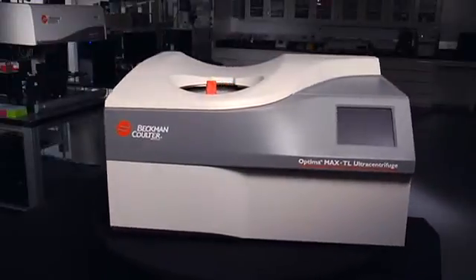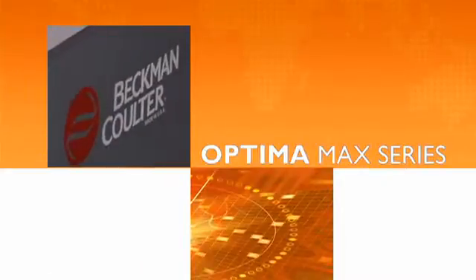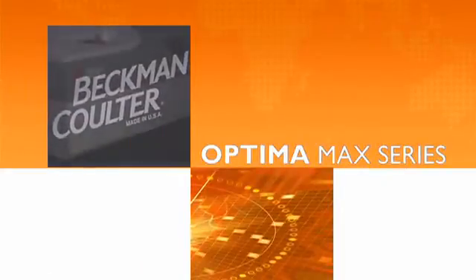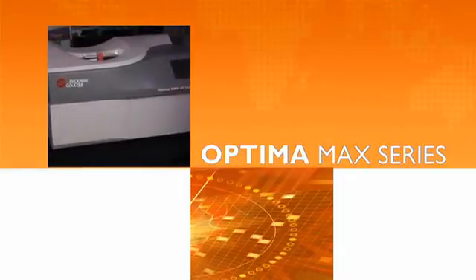The Optima Maxx series tabletop ultracentrifuges from Beckman Coulter enable you to meet the demanding needs of today's advanced laboratory environment.